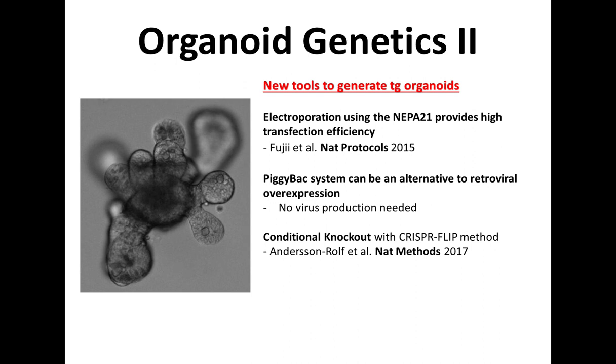Next, when I was in Cambridge, I started working with the piggyBac system. This is a transposon-based system, but it works pretty much like a retrovirus or lentivirus, so that anything that is in between the two ITRs can nicely be copied into the genome upon transfection.